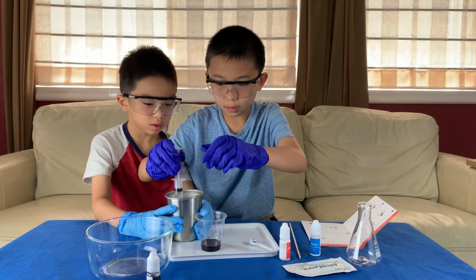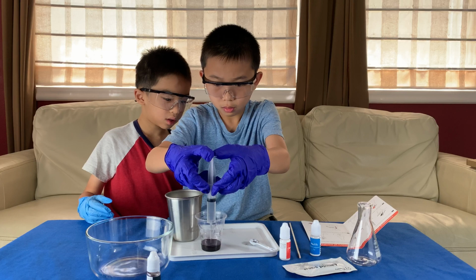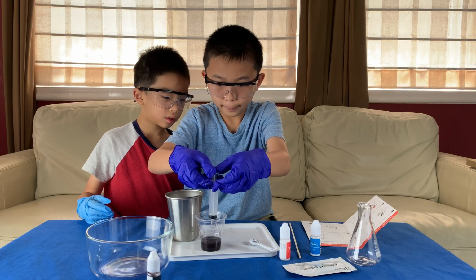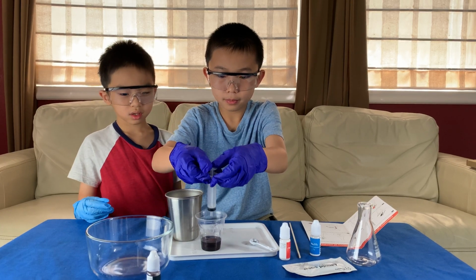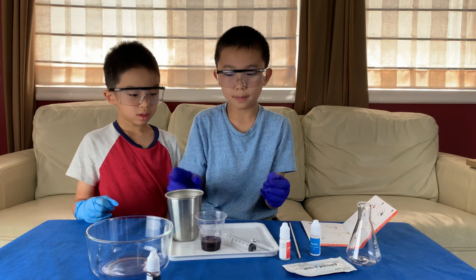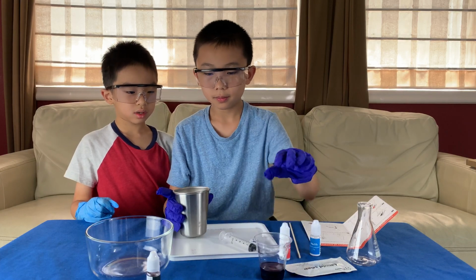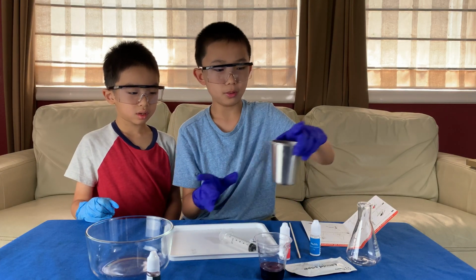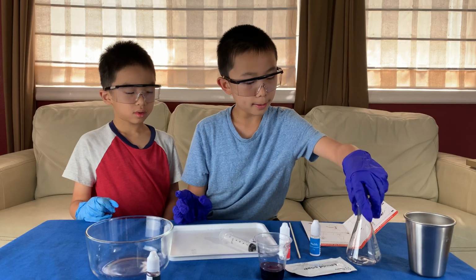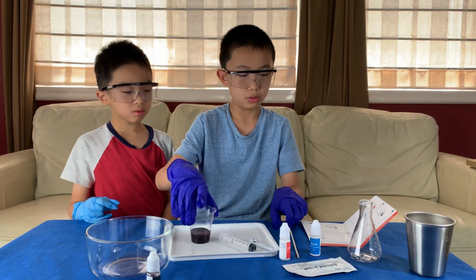All right, here. I'll do this one. Okay. We're done with this cup. So now we're going to set it aside. We're done with the water. And now we need this. Oh, no, we still need to stir it with the wooden stick.